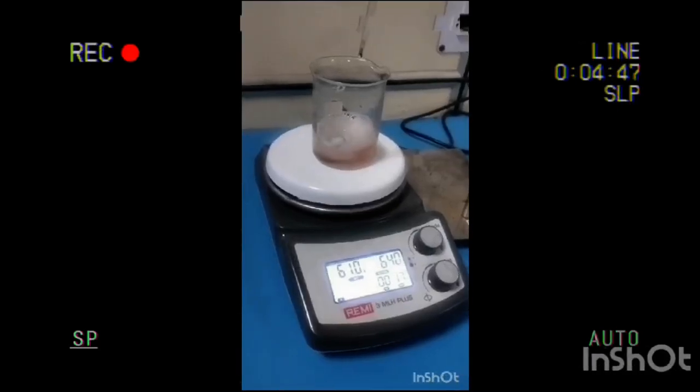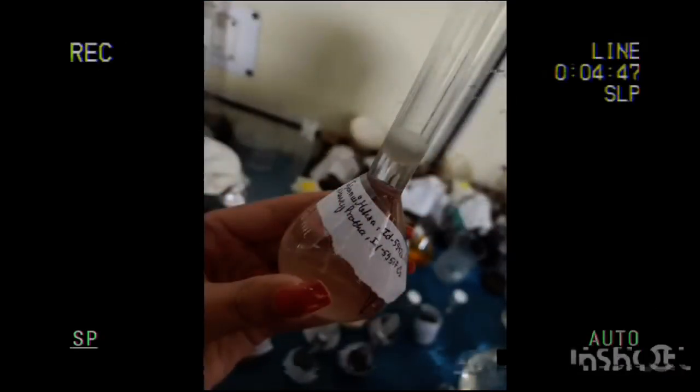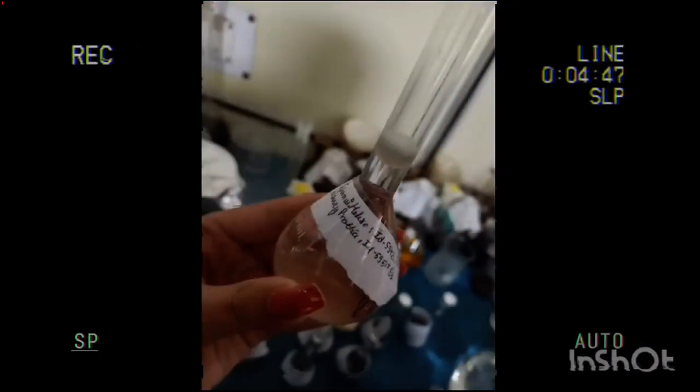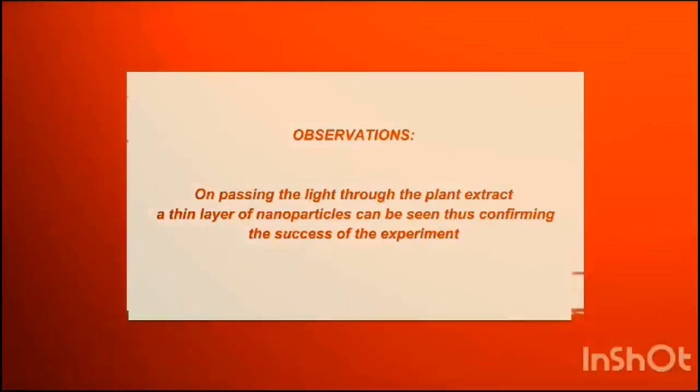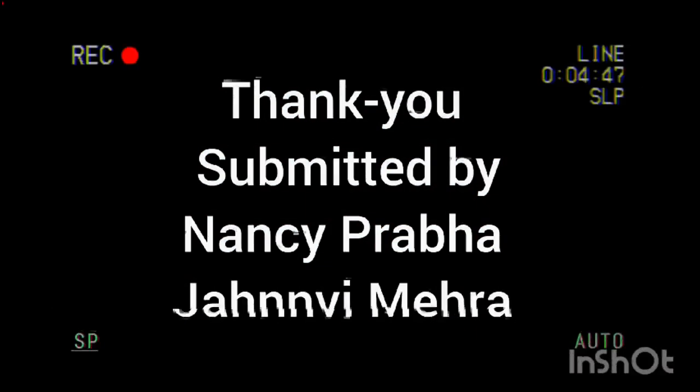The burette is then filled with 40 ml KCl. Drop by drop KCl will fall on the beaker with extract. After 30 minutes, close the stirrer and check. Now with this sample, when we pass light through the plant extract, a thin layer of nanoparticles can be seen, thus confirming the success of this experiment.